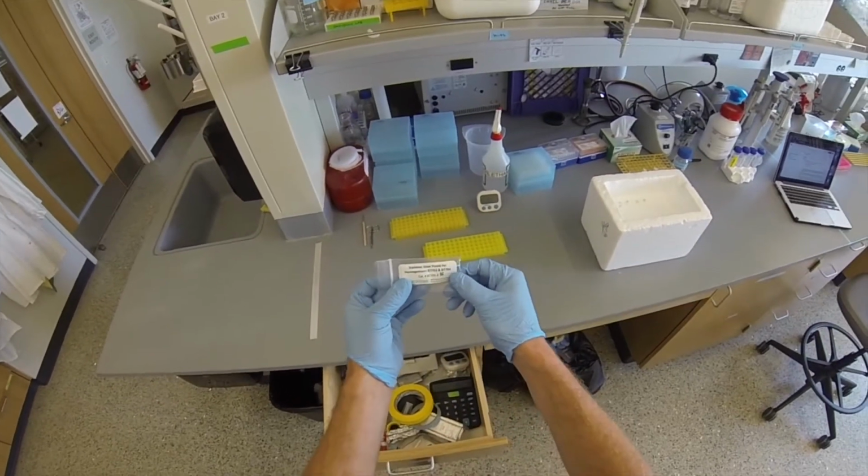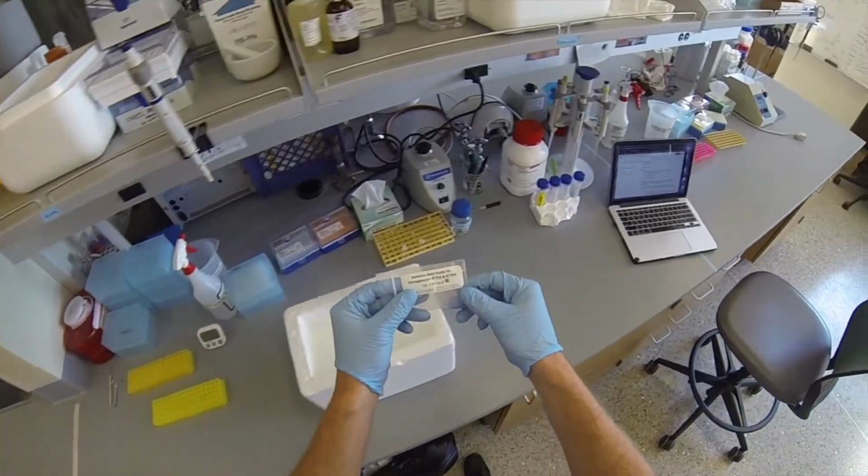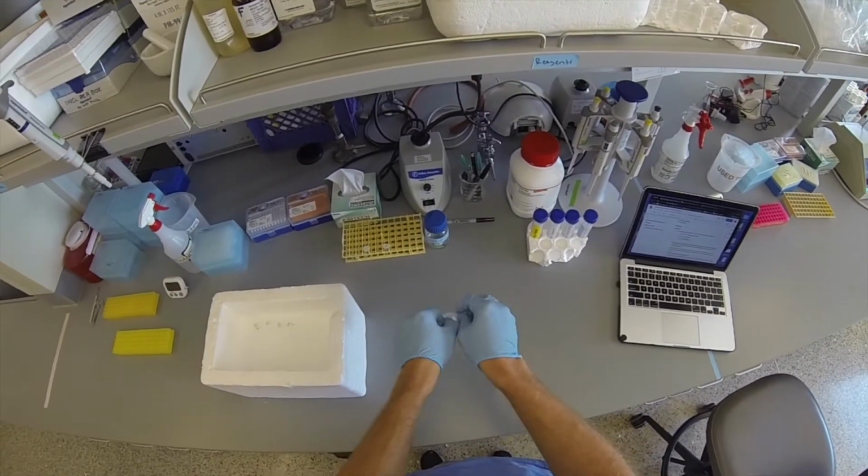Now we need to prep the tissue homogenizer. You can clean the tissue homogenizer using 70% ethanol and then wiping down with a paper towel or chem wipe.